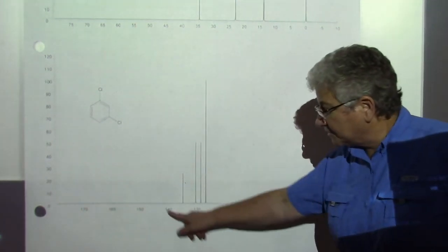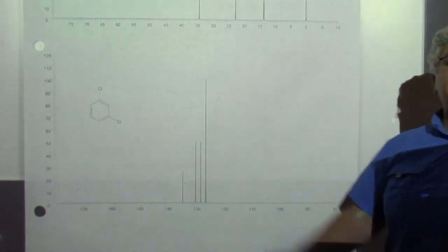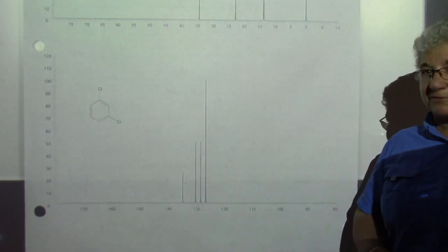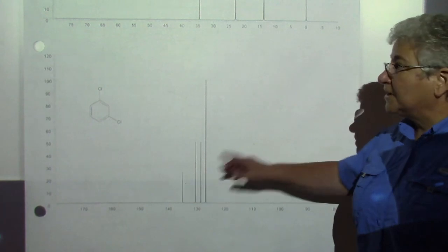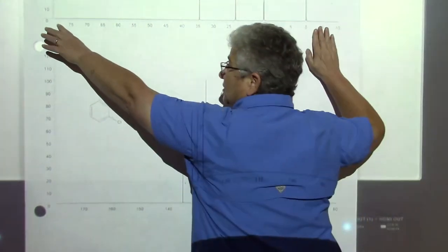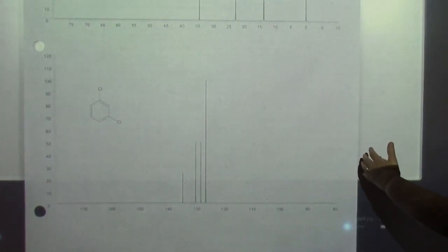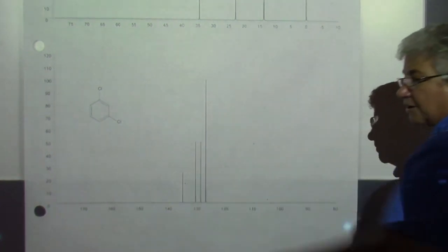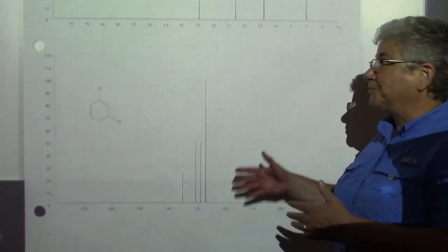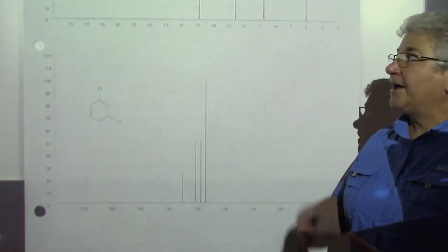If you look at where these 4 peaks are, they are about 128 to 135 or so, right? Almost 100 ppm further downfield. And so the truth is that when you're paying attention to chemical shift, right now this spectrum runs from 0 to 75. This whole spectrum would actually be to the right of 80 to 140. So even though they're sort of in the center of your page here, they have very different chemical shifts.